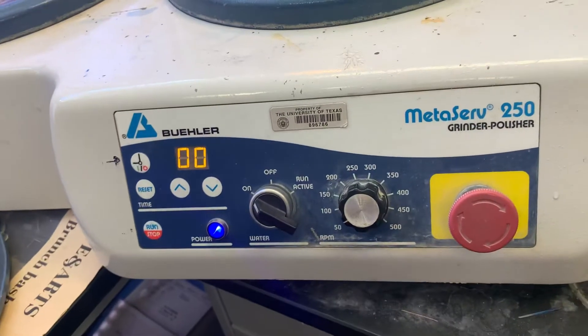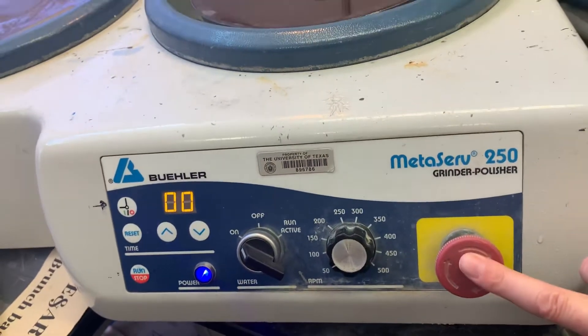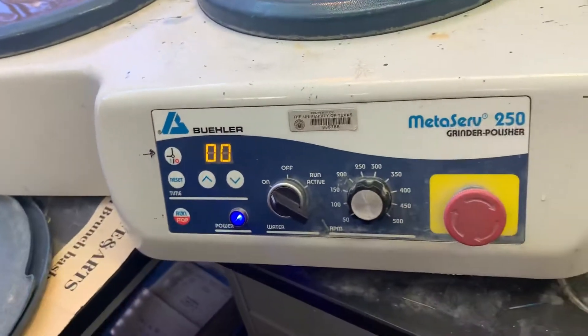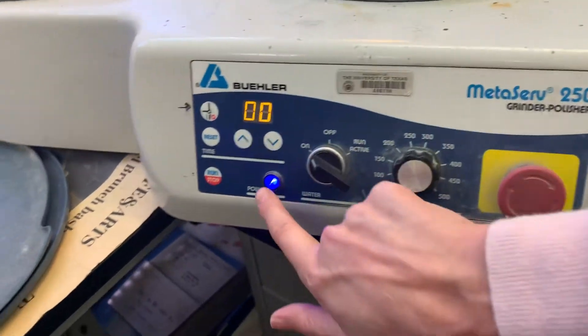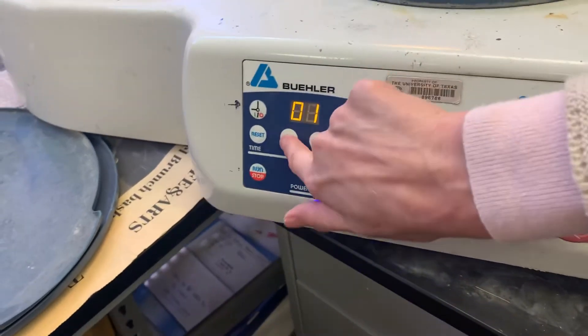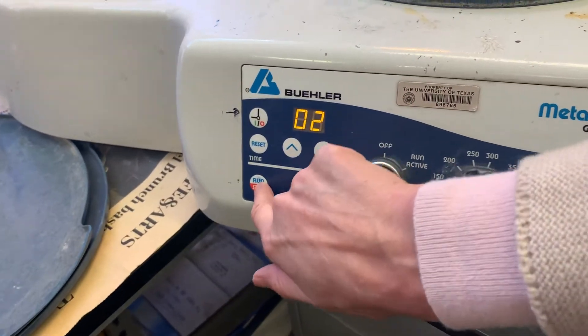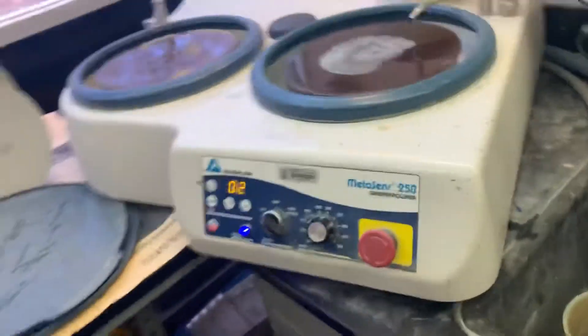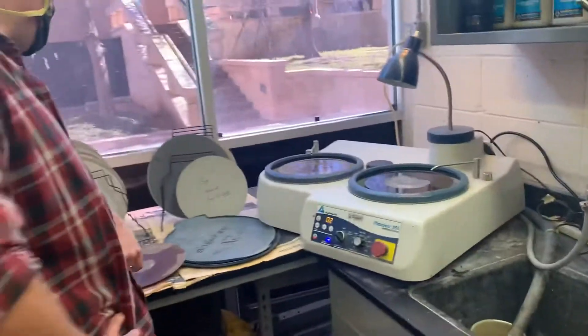I just pressed the red button which stopped everything. Oh, actually it was the timer, wasn't it? Okay, so the run/stop button is important and the timer value is important — you can press run so that it actually starts to move.